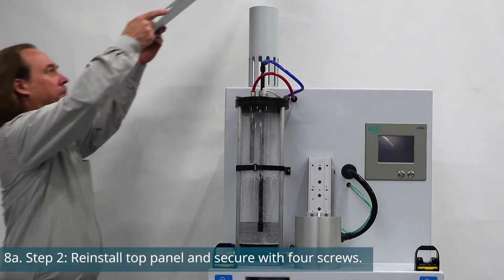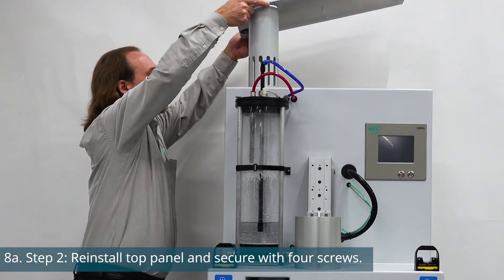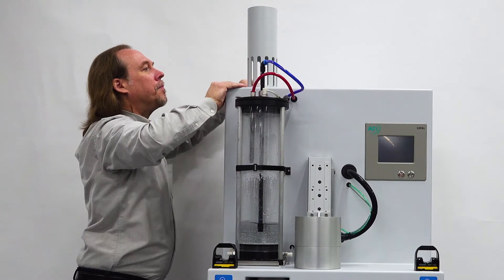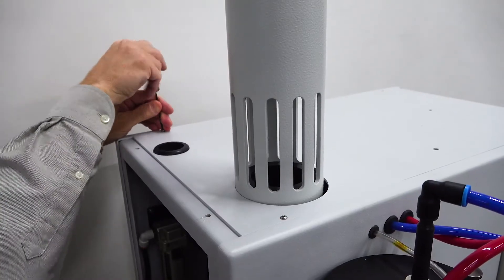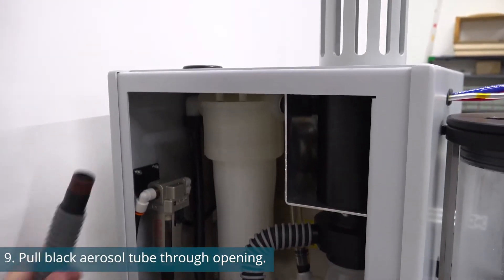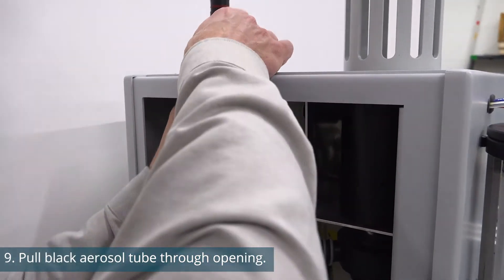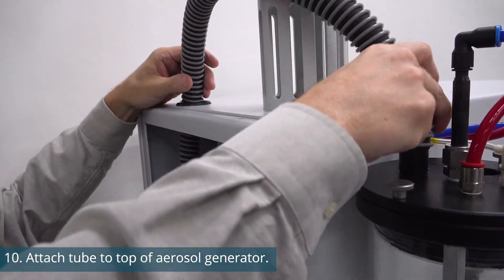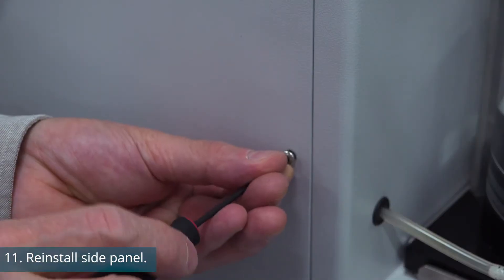Reinstall the top panel and secure it with the four screws that were previously removed. Pull the black and gray aerosol tube through the opening in the top of the unit. Attach the tube to the top of the aerosol generator, then reinstall the side panel.